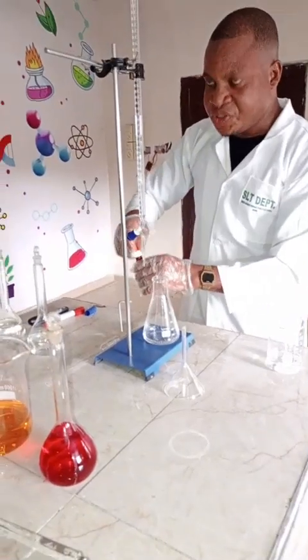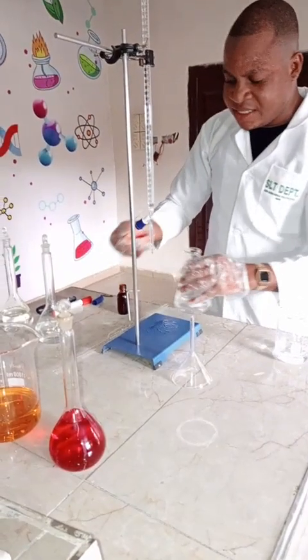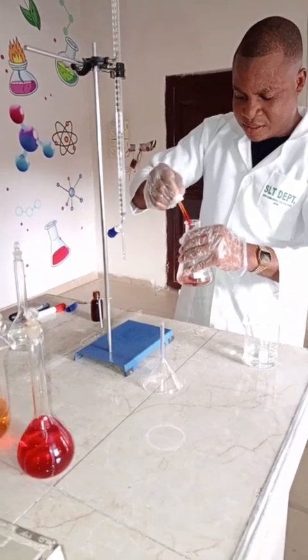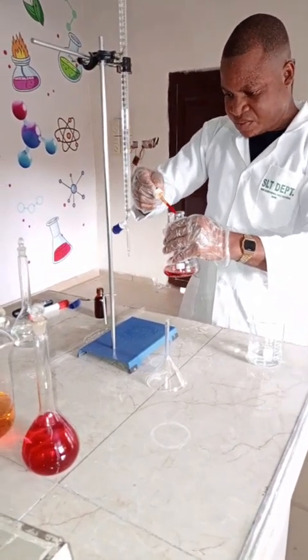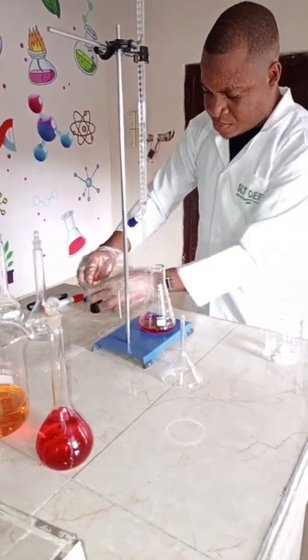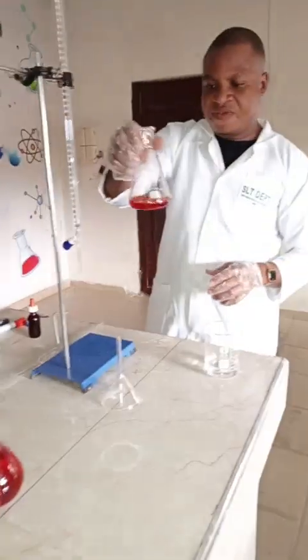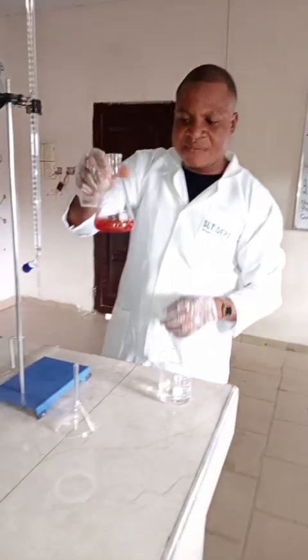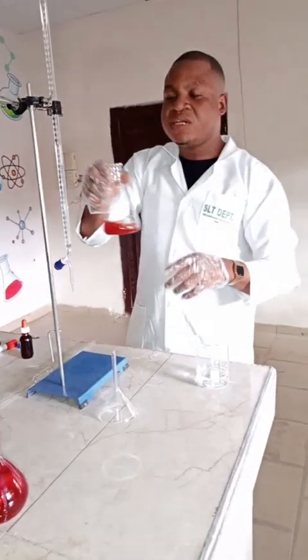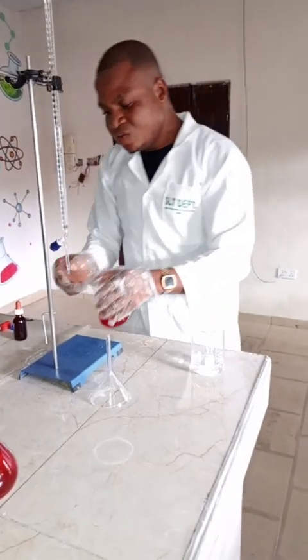I'm going to introduce 2 drops of the indicator material. This is 1 and this is 2. Now this is what we have. This is our starting point. We are going to take it gradually until we notice a different color from our starting point. We are going to titrate.